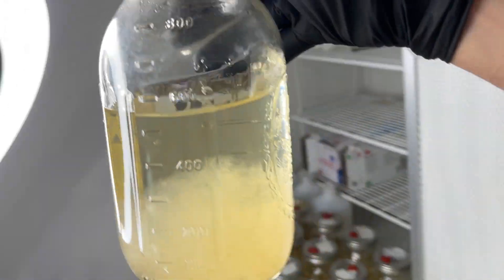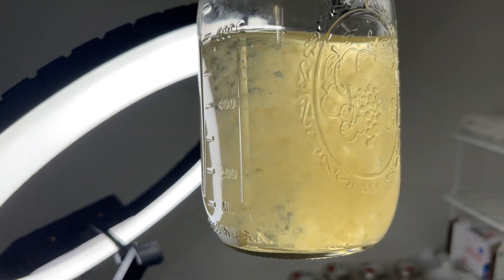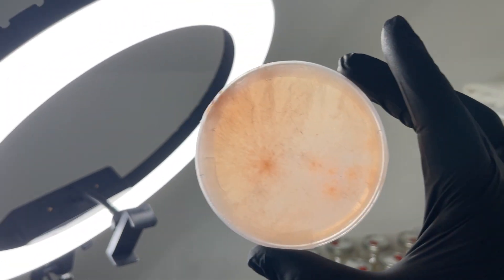The next example is pink oyster mushroom, which always stays a solid white color in liquid culture. But if you put it on agar or grain spawn, it will start turning a shade of pink.